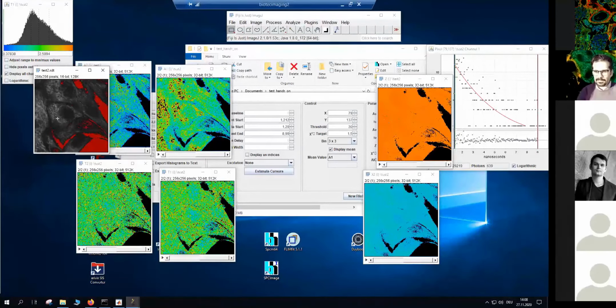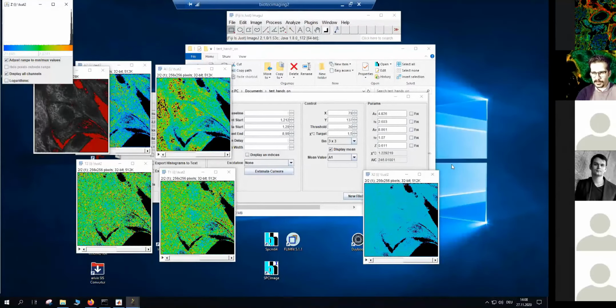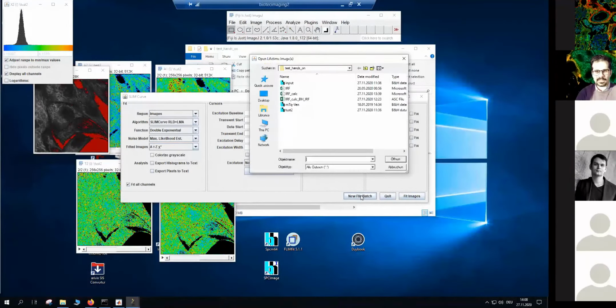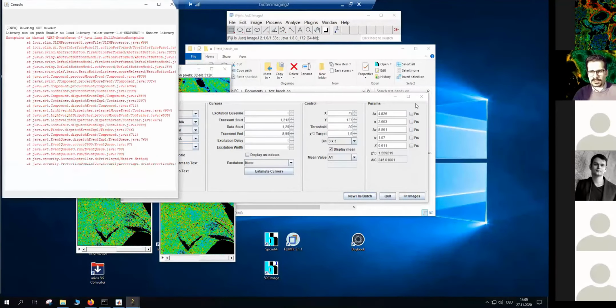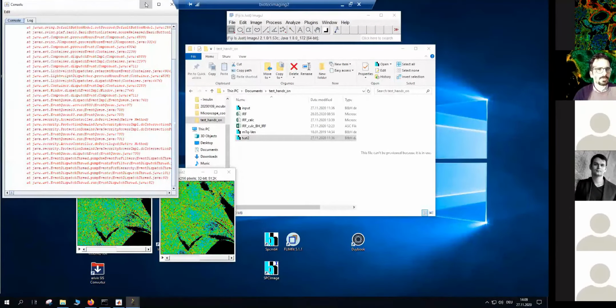So here we are with the SLIM curve. If there is no other question, just adding very tiny things, otherwise I'm going to close all the windows: you can add several files as well and do the fitting, either globally or one by one. Okay, so I'm just going to close it. And yeah, ignore the log here.